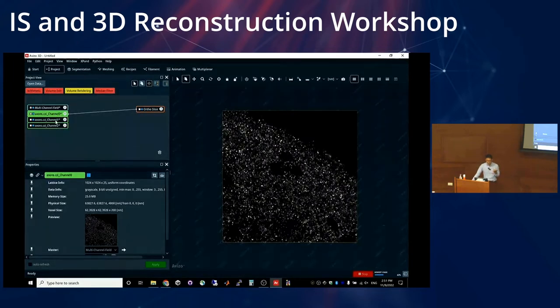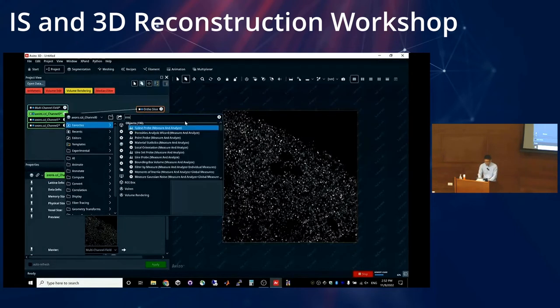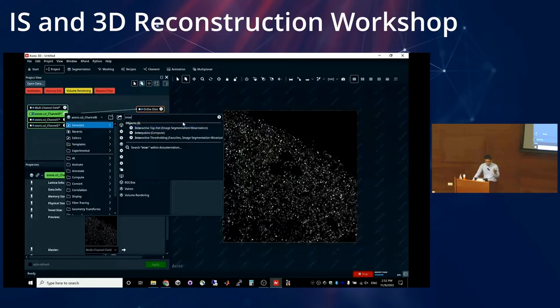I'll just do channel 0, so that chemical and the axons, okay? Of course, you can do channel 2 as well. So for channel 0, I would actually just do thresholding, because as you can probably tell, or as the user told me, the high intensity values is where the chemicals are concentrated, right? Which makes sense. And I won't even go to the segmentation tool.